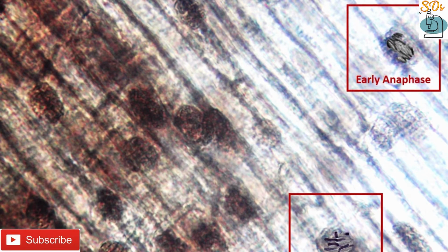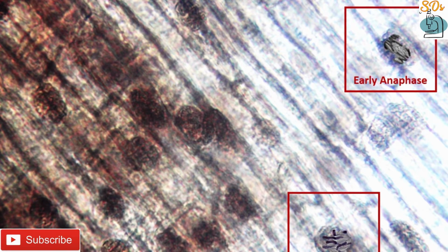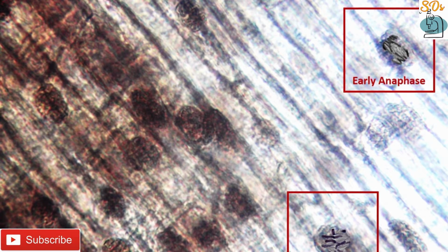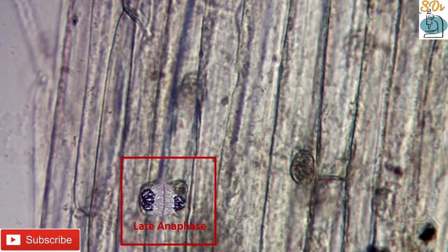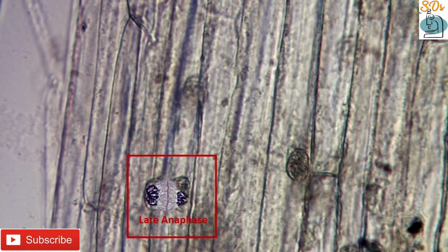Next one, anaphase. Here also I got two shades of anaphase, early anaphase and late anaphase. In early anaphase, each chromatid pair separates from the centromere and moves towards the opposite ends of the cell by the spindle fibers. In late anaphase, the cell membrane begins to pinch at the center.